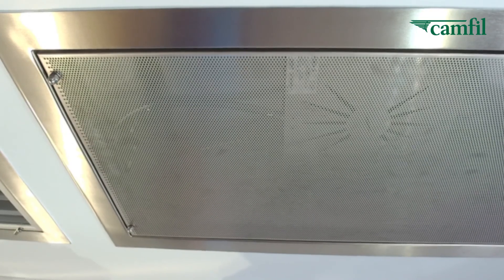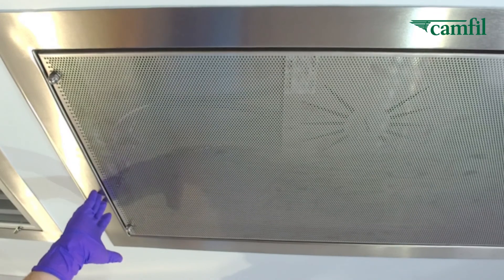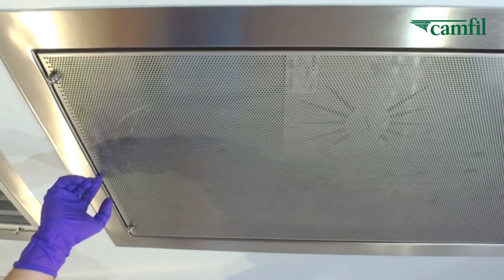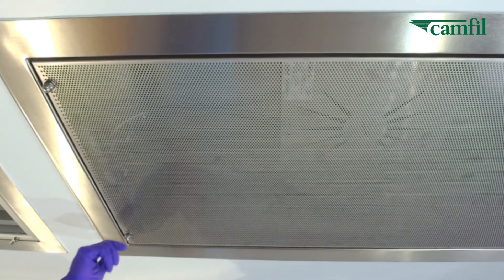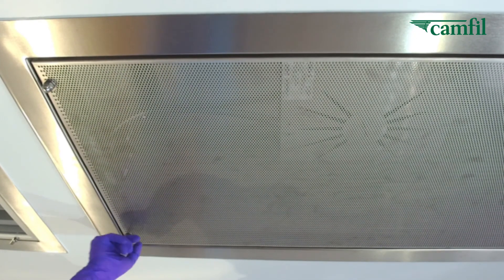The PharmaSlim features a stainless steel grill with a finished edge to avoid any concerns about cutting a glove or a hand. It also has acorn nut fasteners that can be removed manually.